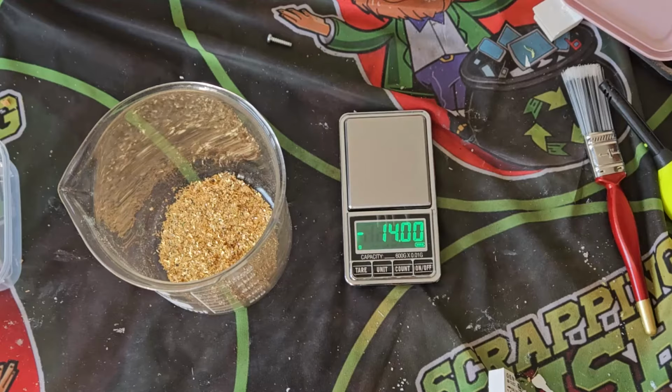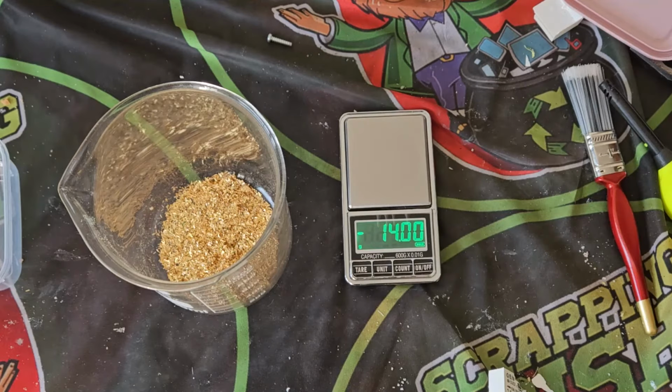So again, hydrochloric acid, you can find it in most hardware stores, plumbing stores, garden centres, swimming pool supplies, stuff like that will have hydrochloric acid or muriatic acid, and bleach is just regular household bleach that you use for cleaning. So that's what I'll be using.